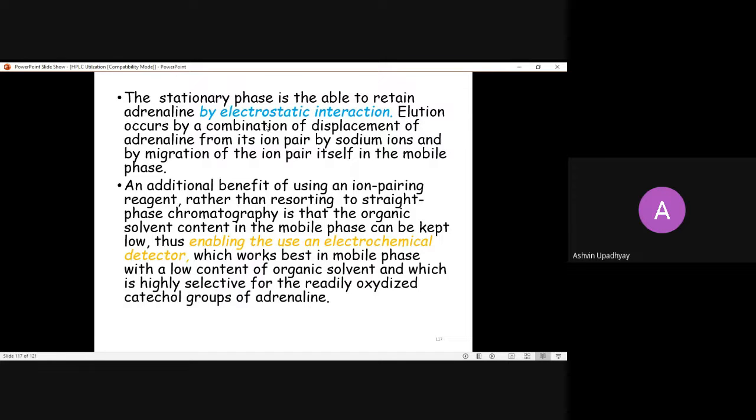So in both types of ion pairing chromatography HPLC technique, two types of displacement of the ion pairing occur, once with the stationary phase and another with the mobile phase. So your separation is much better compared with conventional HPLC. With ion pairing technology, you may get properly resolved peaks of the impurities, because there are two types of displacement here, once with the stationary phase and the component, and second with the mobile phase and your component. So two types of separation technique take place.